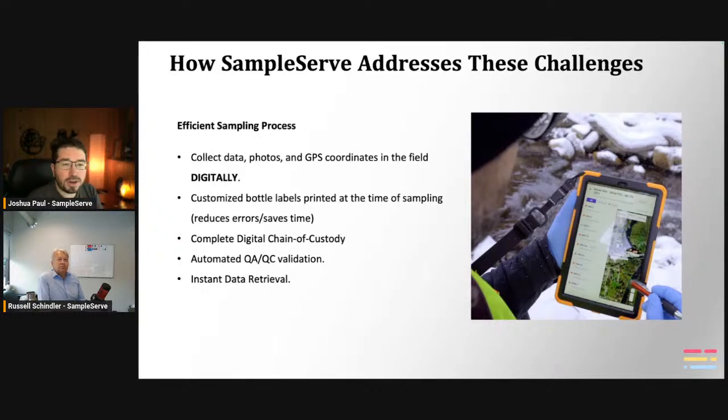It has to be stored in a database, and somebody's got to make reports on it. We're not doing the entire process on paper, but oftentimes it starts out on paper and somebody's job is to put that into a computer somewhere. So when you start the data digitally right out there, you stop a lot of errors. There's no bad handwriting. And you can also put in data qualifiers, as opposed to a paper form, where somebody's writing something down and can write it in their own format.